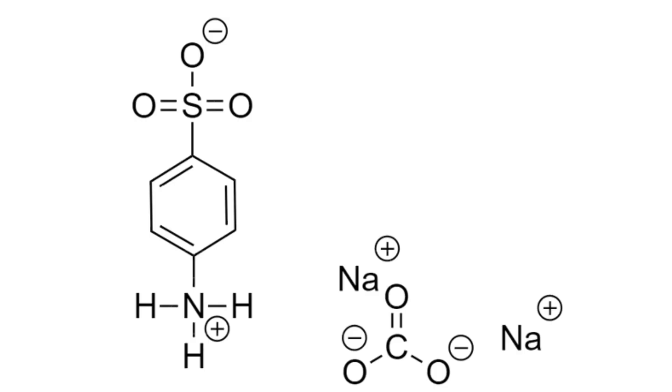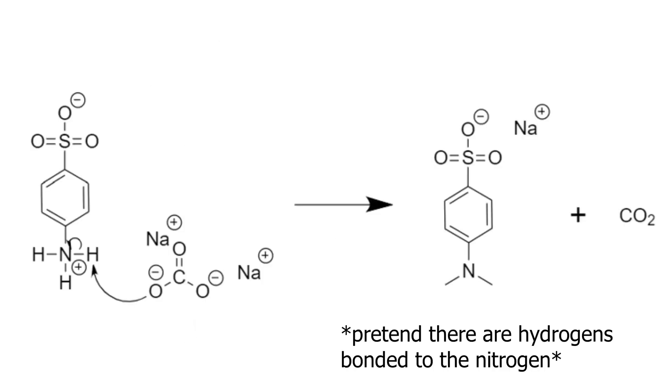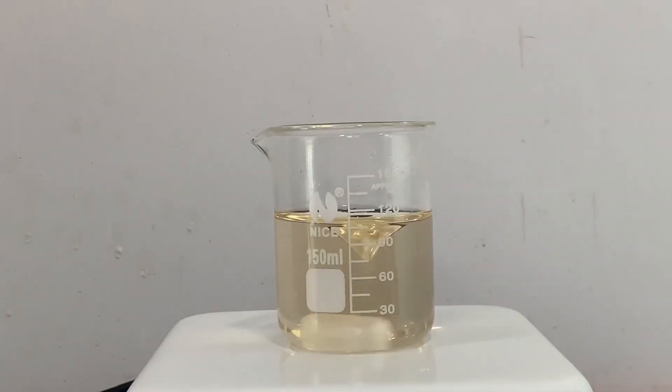The reaction happening here is that the sodium carbonate deprotonates the sulfonylic acid, which produces sodium sulfonylate and carbon dioxide. After adding all of the sodium carbonate, the obtained solution should be clear.